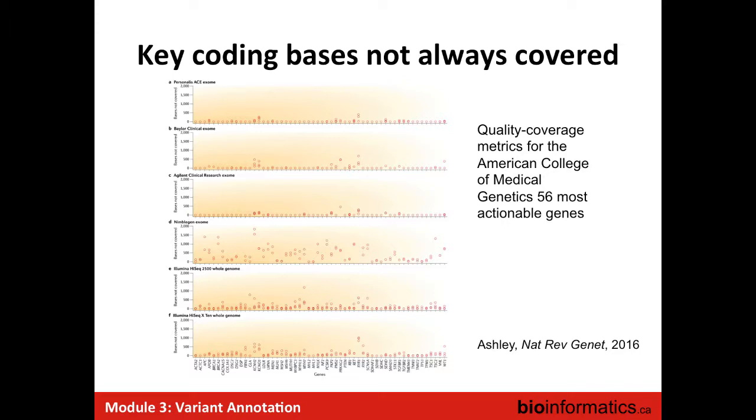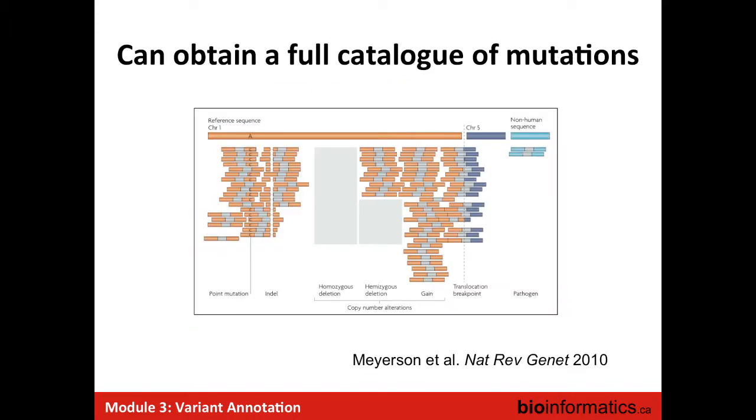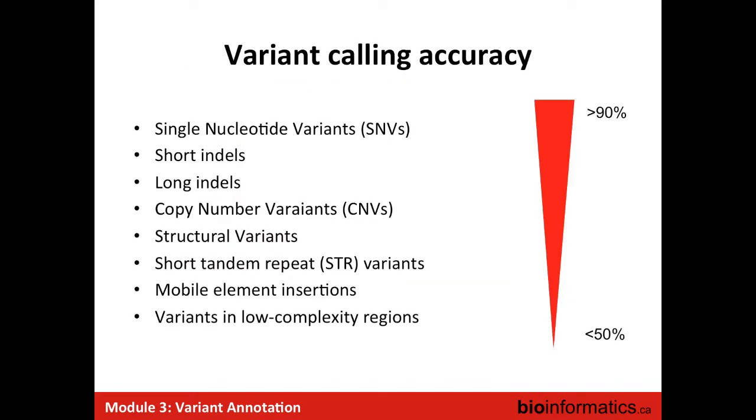So do you think that long read sequencing can overcome this issue? Yeah, long read sequencing will overcome the issue of having more uniform coverage and definitely help with these harder types of repeats. For example, if you have mobile insertions of L1 that are too long for the short reads, you can't detect them. But with the long reads, you will be able to.